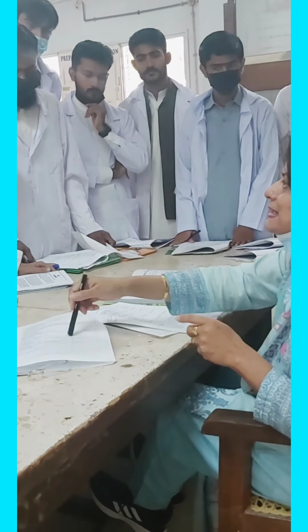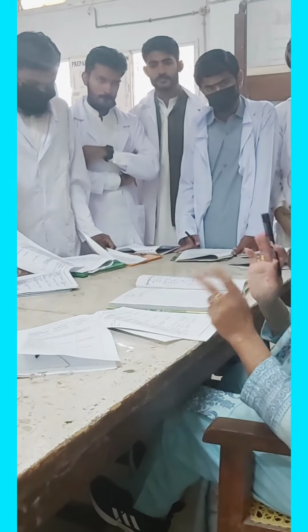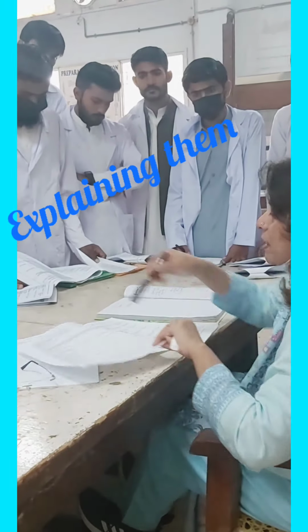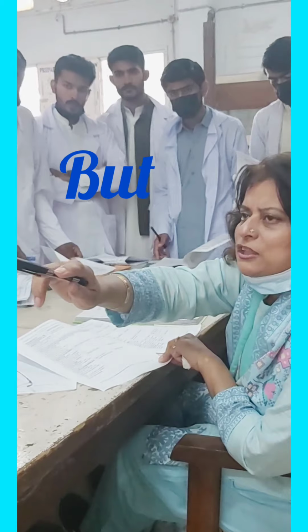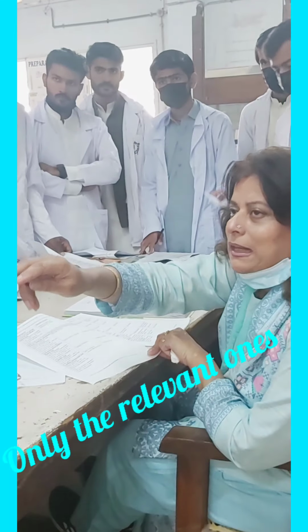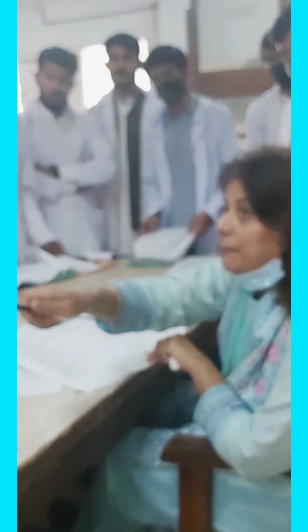This is what they are saying here in the scheme, that based on your previous results, you have to move on and select your tests. There are a number of tests. Here there are so many tests, 15-20 tests. Will we do all of them? Are we supposed to do all the tests for the classification of the functional groups in our organic compound? No, ma'am.